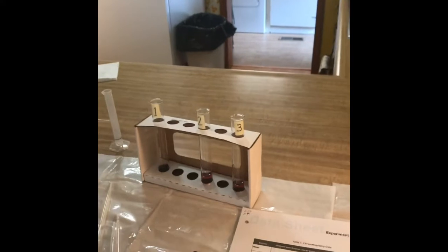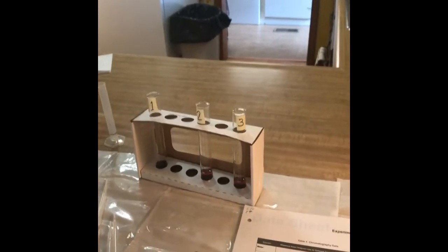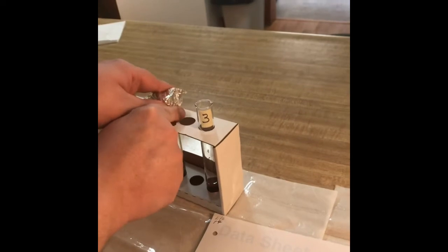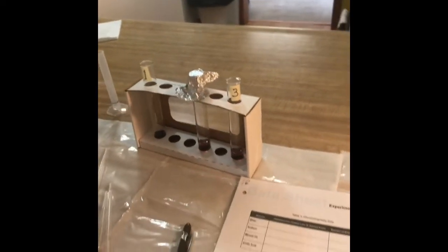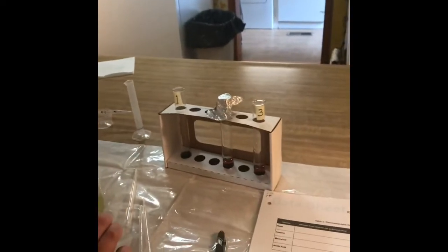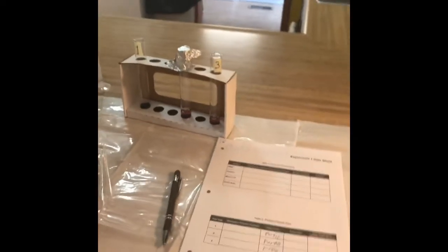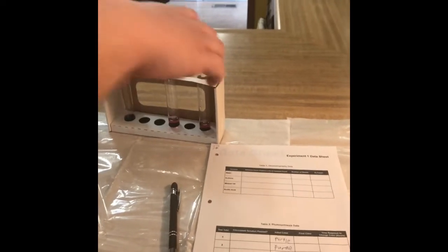Now I am covering test tube 2 with aluminum foil so that no light can get into the test tube for step 5. And for step 6, I am going to place the test tube rack with the 3 test tubes under an incandescent light, since the sun isn't shining today, where I will leave them for 3 to 8 hours as I continue to observe them.